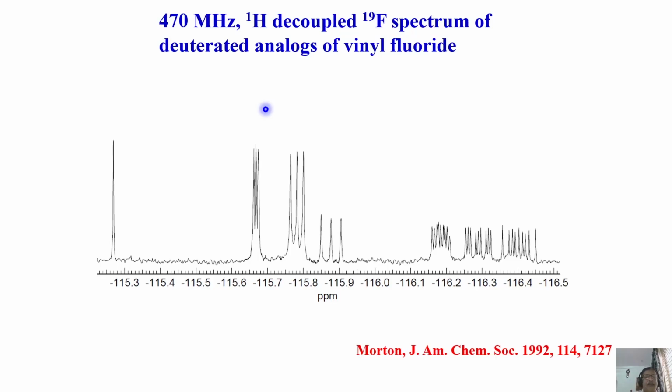Now, this is a similar molecule. There it was a tin-119 NMR. Now it is a 19F NMR, and this is the molecule. Remember, it's proton decoupled. I am looking at fluorine NMR with proton decoupling, so all proton couplings are completely removed. If only one fluorine is substituted and no other couplings are there, of course, don't worry about carbon-13 satellites. When all the protons are completely decoupled, how many peaks do we expect? Only one peak, exactly what you see.